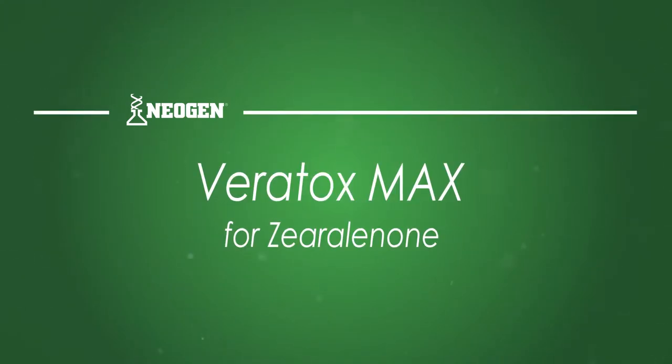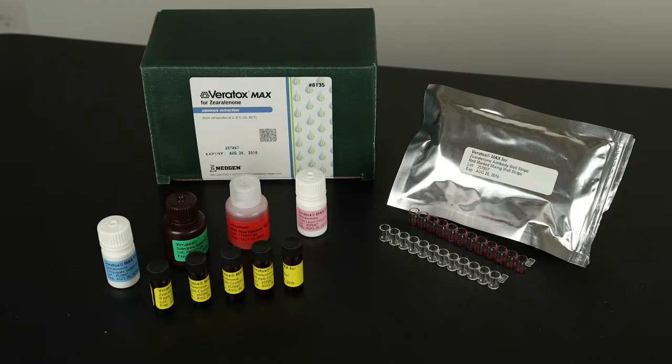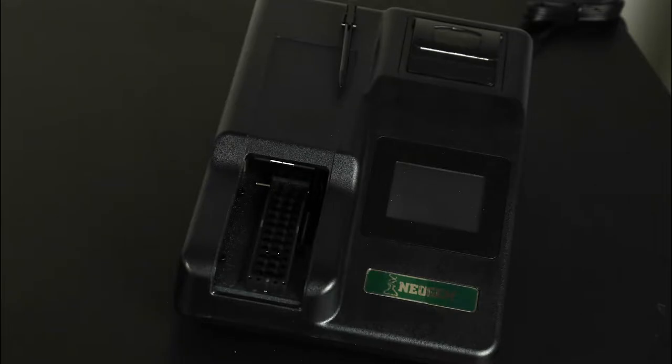This training video guides you through the steps to successfully conduct the test using Neogen's Veritox Max for Zearalenone test kits and the StatFax 4700 Microwell Reader.